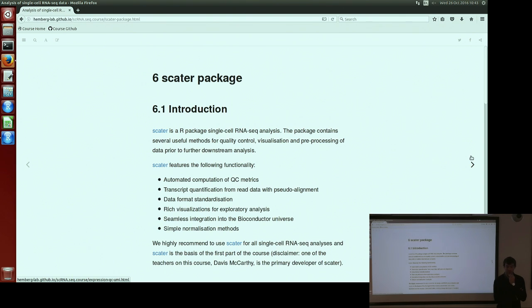So what we want to do is visualize the data, QC the data, pre-process it in various ways, poke it, see what it looks like, and then filter out cells and genes that we don't want so that we have a nice, clean and tidy data set that's ready for statistical analyses focused on whatever our scientific questions of interest are.